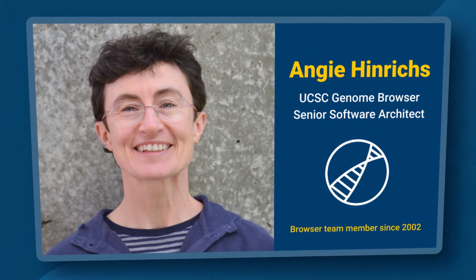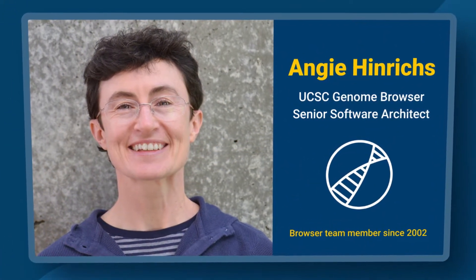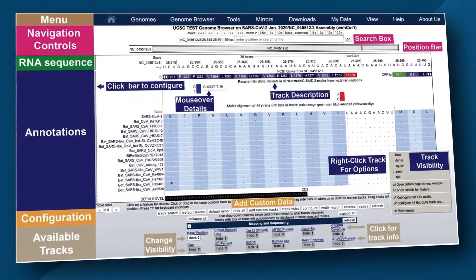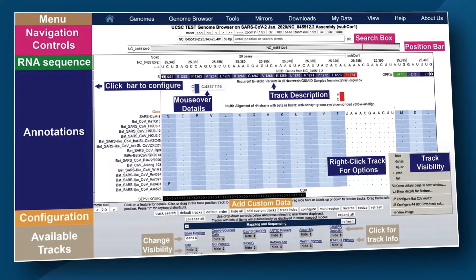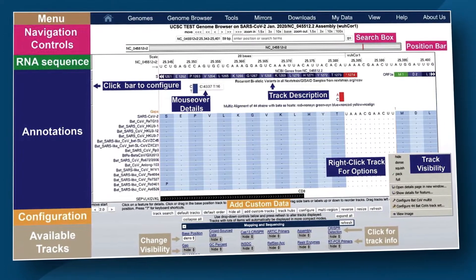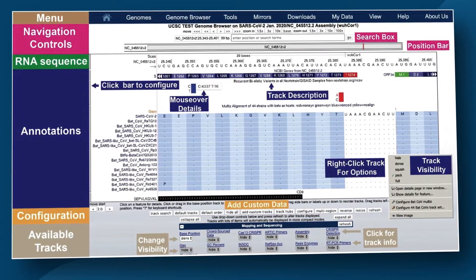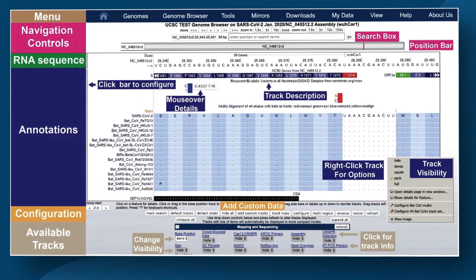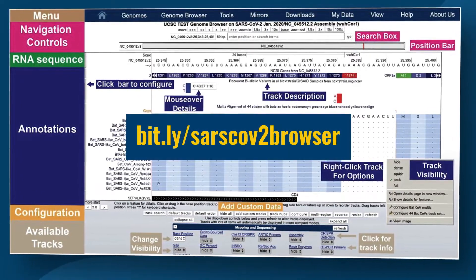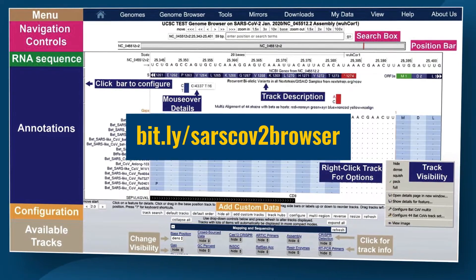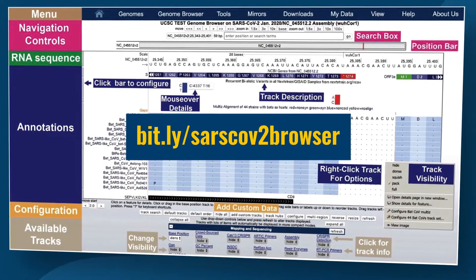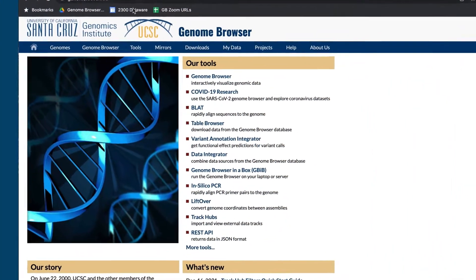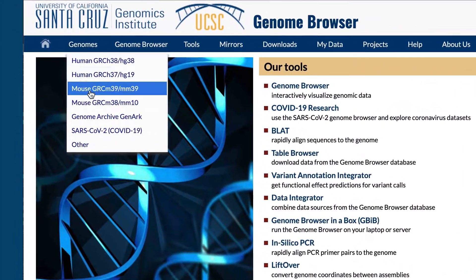This brief introduction, created by UCSC Genome Browser Senior Architect Angie Hinrichs, is designed to familiarize scientists with the basic workings of the genome browser and to show some of the data available to explore. At the end of the video, we'll link to resources for learning more. To open the SARS-CoV-2 Genome Browser, click on the link in the video, or use the menus on genome.ucsc.edu.